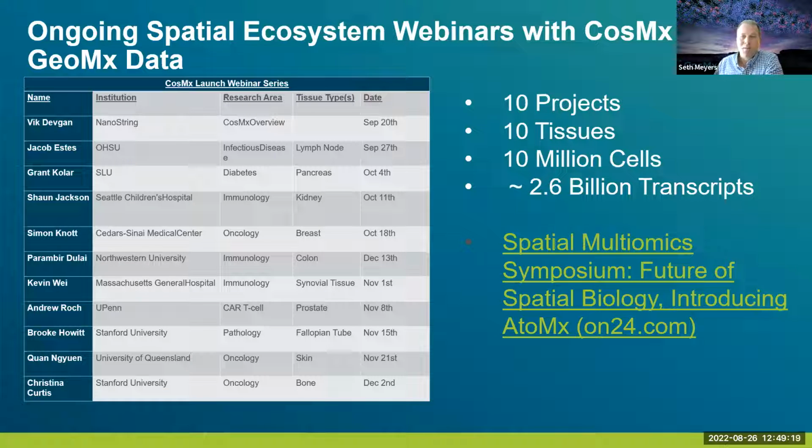That's a great question. So, cell characterization panels for mouse and rat. On our product horizon, we have human and mouse. Mouse certainly will have a 1,000-plex mouse cell characterization panel that'll come out as well. We're also really interested in just hearing what researchers have of interest.